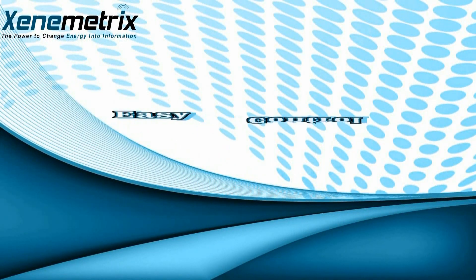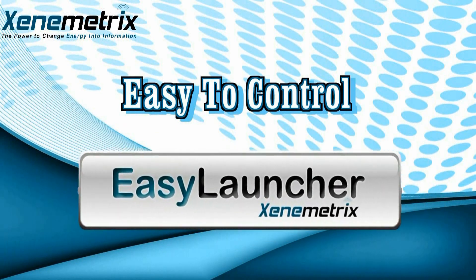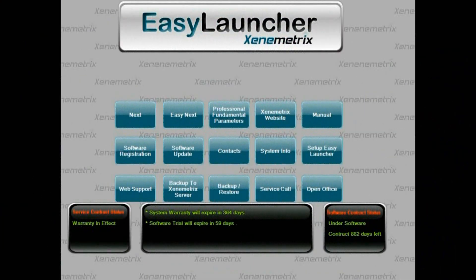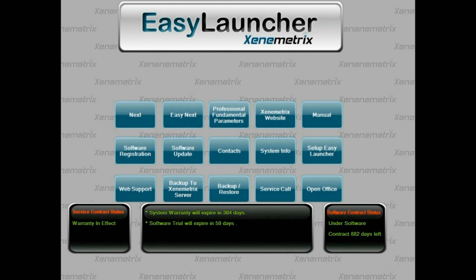Xenemetrix proudly presents its easy-to-control system, the Easy Launcher. This shell interface allows easy control and operation of all analytical tasks. These include access to the Next analytical package, running advanced fundamental parameters tools, viewing the operational manual, requesting and establishing web-based remote support, automatic backup scheduling including cloud-based server backup, software automatic updates, and more. This great tool makes system operation an easy task for any user level.